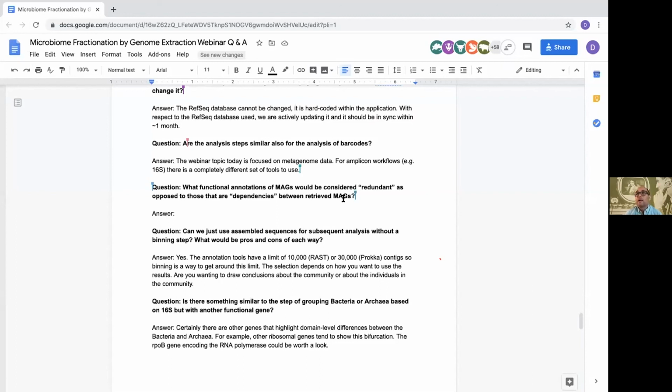So, I would say if you look at the pathway, the sequence of metabolite transformations, and the enzymes are very patchwork, meaning sort of interspersed gaps that are complementary, that's probably a case where you needed to merge the MAGs. And it's hard to picture that many transporters and that much pathway completeness being handled by a metabolite interdependency between those cells, passing that metabolite back and forth that much through transporters.